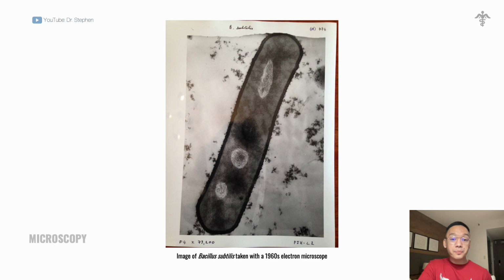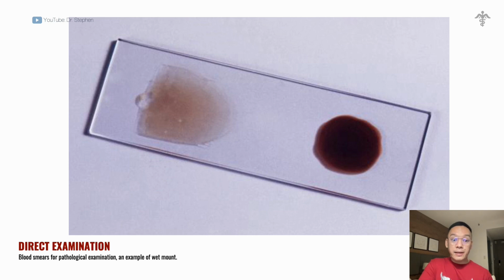You can see here how detailed the structure of these bacterium is. With our next processes in medical microbiology using microscopy and in vitro cultures, we are going to talk about direct examinations.